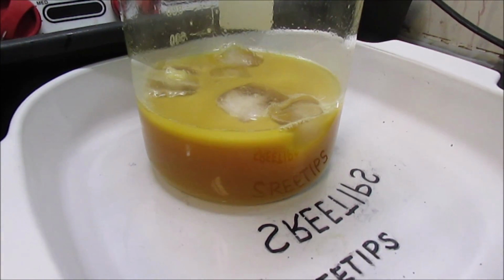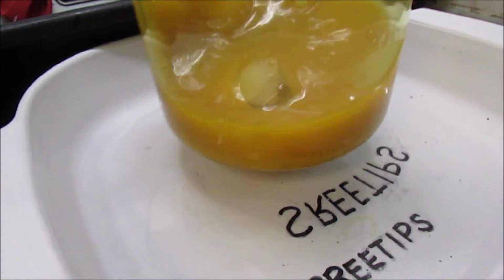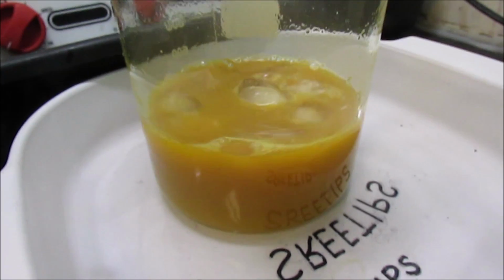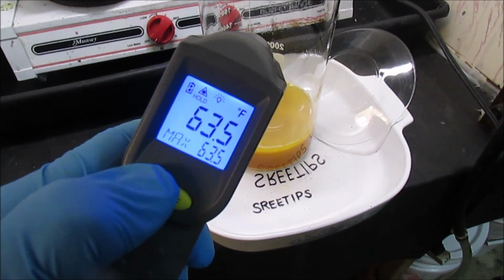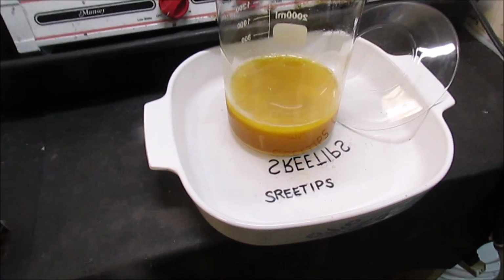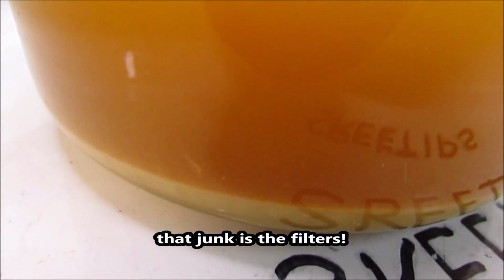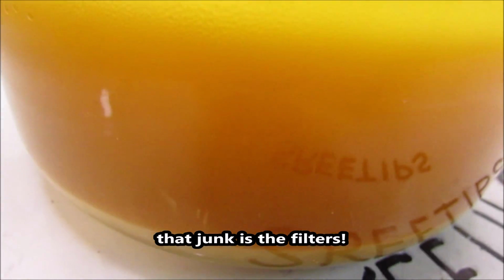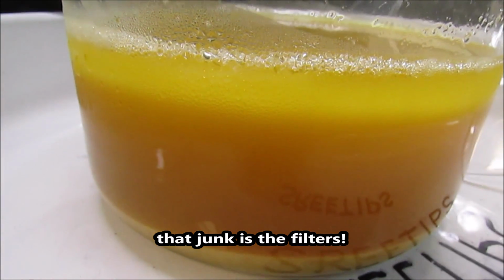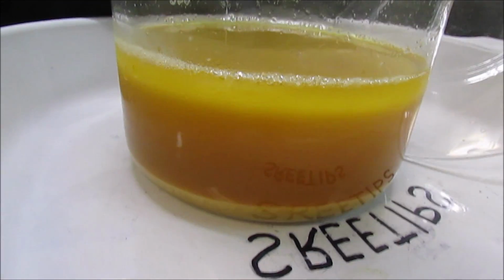Add a few pieces of ice here to cool the solution down. Got the solution down to 63 Fahrenheit, 17.6 Celsius. If you look down here after adding that ice, I've got a bunch of junk precipitating out. I'm not quite sure what that is. But rather than try to pour this through a filter, I'm going to siphon it.